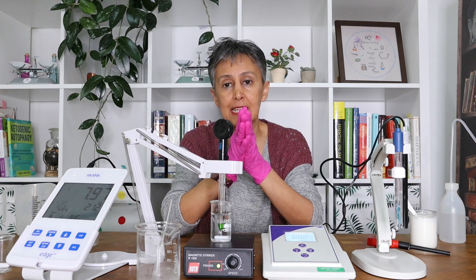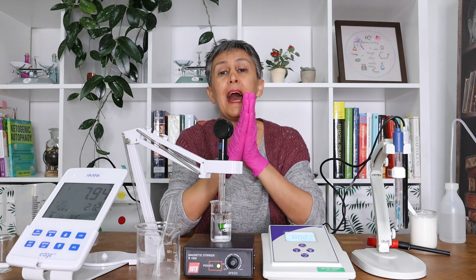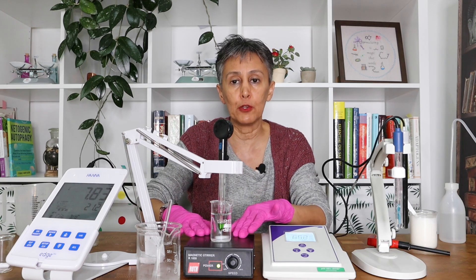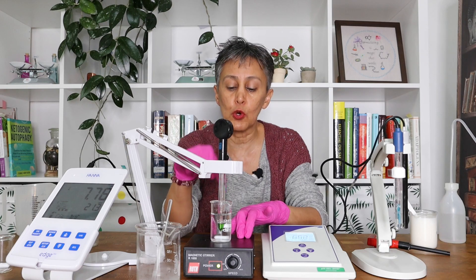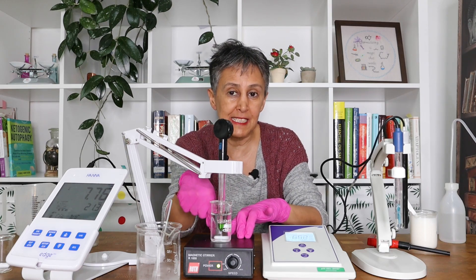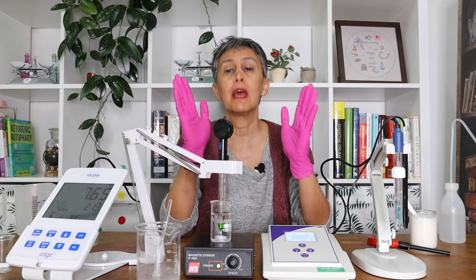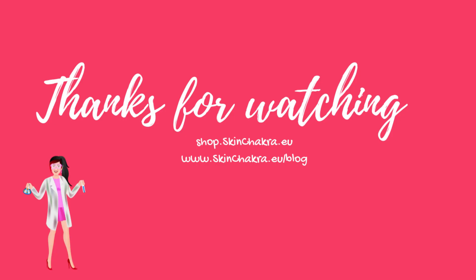For heaven's sake, please do not use your electrode as a stirring rod. Use a stirring rod or a magnetic stirrer to prepare your samples and to measure the pH. Do not bring the electrode to the bottom of the beaker or measuring vessel. Follow these steps and you will take care of your pH electrode and get accurate results.